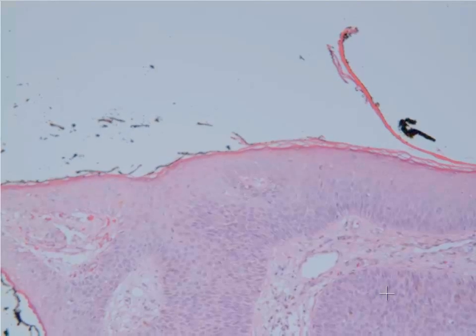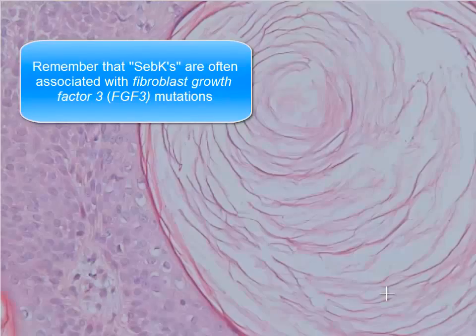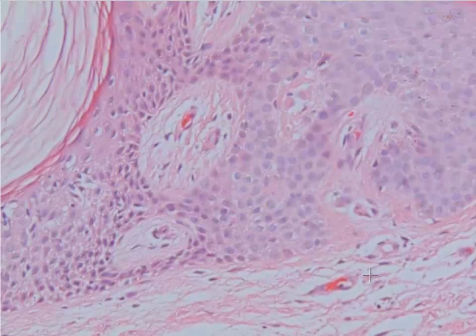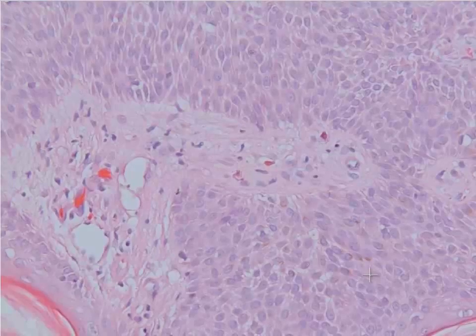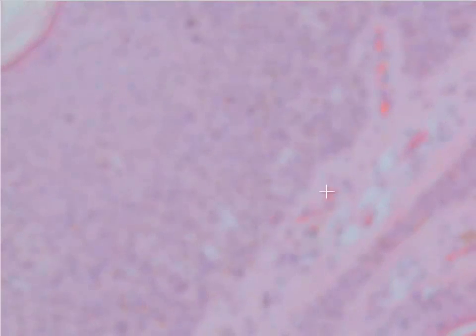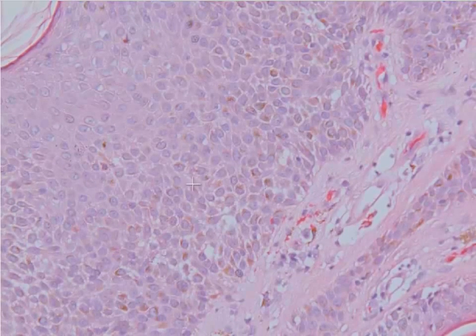One of the other things you commonly see in these is that they can become pigmented. Often in the clinic this may look like a pigmented lesion that could raise concern for melanoma; however, they're completely benign. In this one you can see in these cells that we have a little bit of melanin pigment scattered around in the epidermis and then in the dermis.